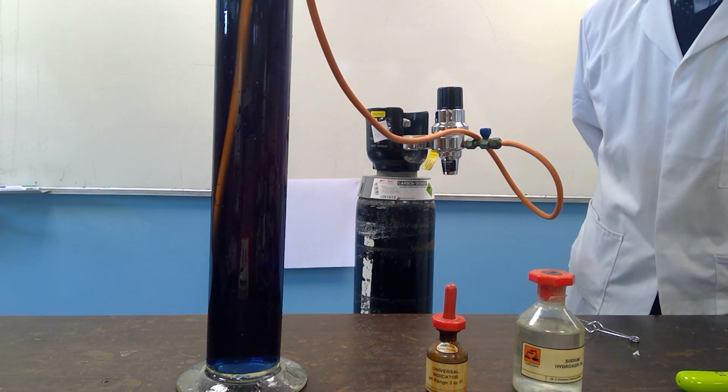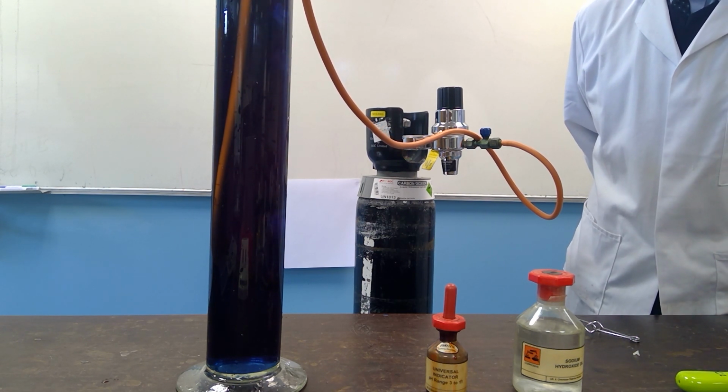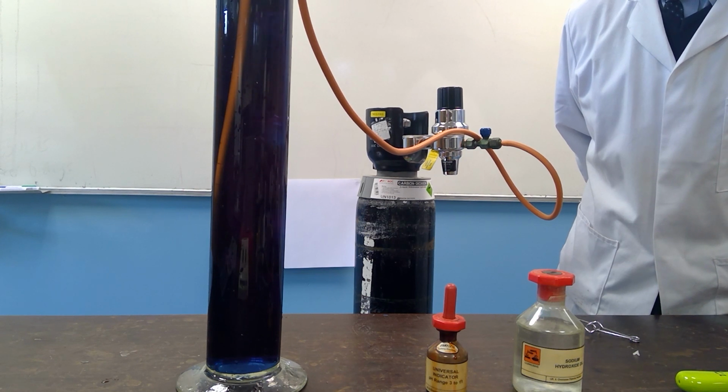As the carbon dioxide reacts with the sodium hydroxide and neutralizes it, the indicator will change color. The pH of the solution is diminishing as the carbon dioxide is added.